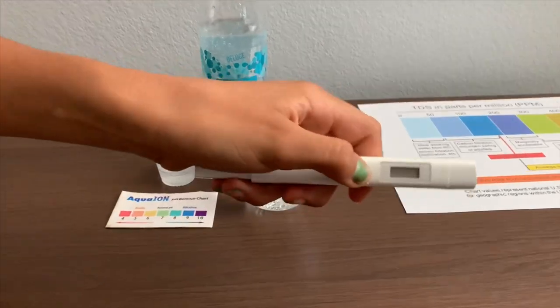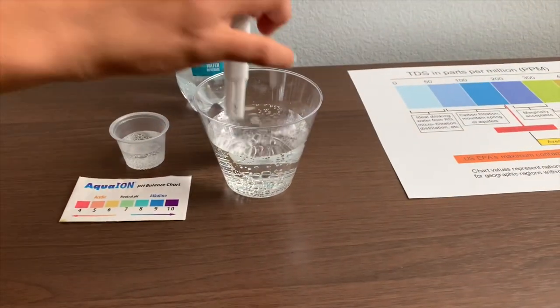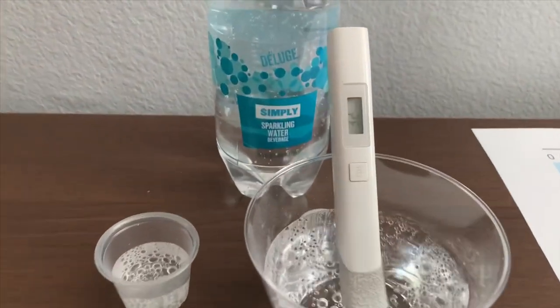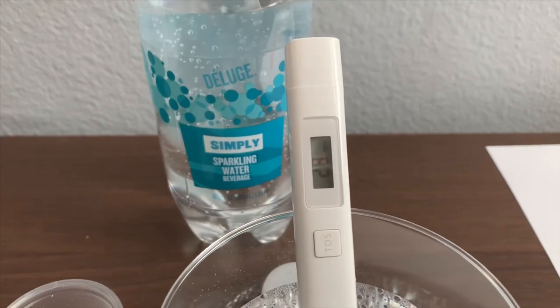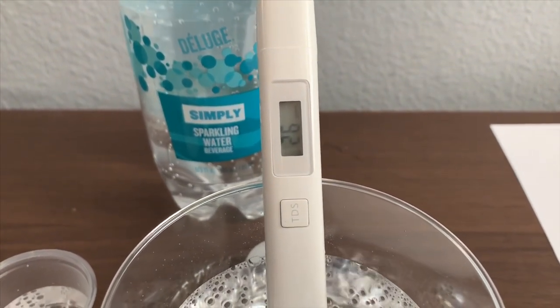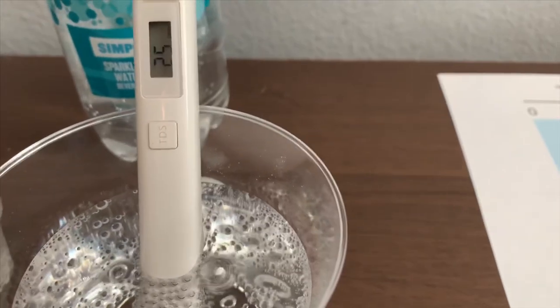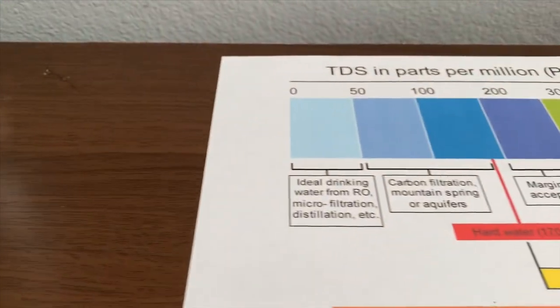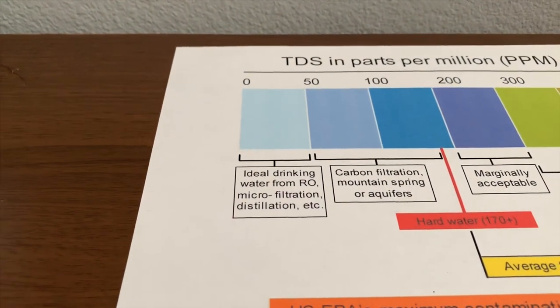Turn on the TDS tester and make sure it says zero. Put it in and let's wait. It's in the 20s — that is ideal drinking water.